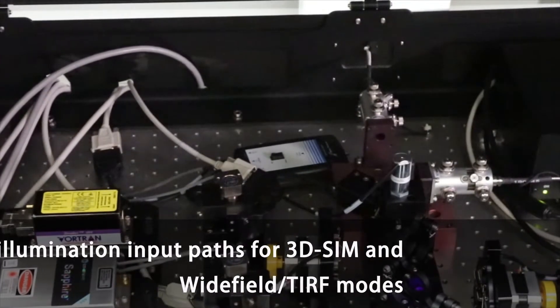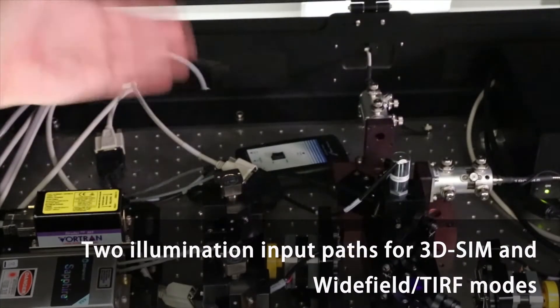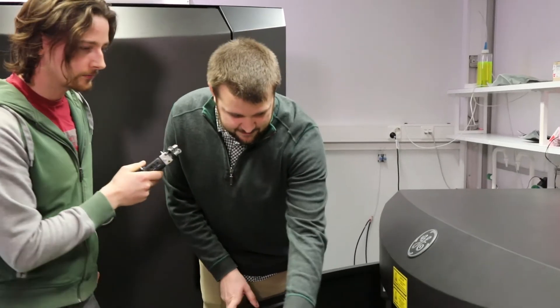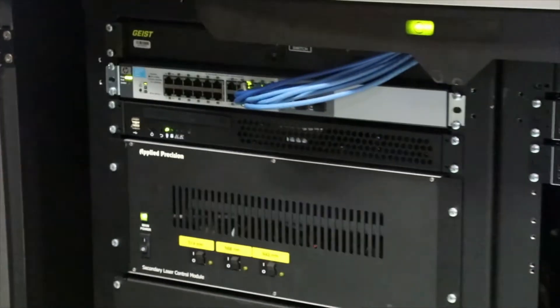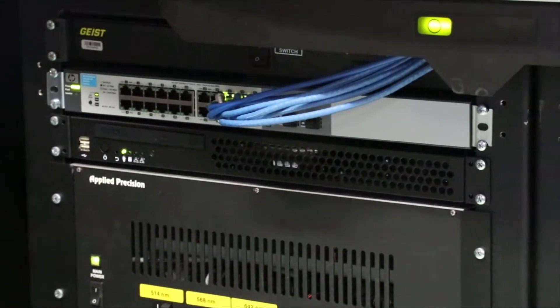The SIM fiber is straight on. If you change to TIRF mode in the software, it'll actually lift that — it's just a mirror on a little flipper motor, which will then direct it down the TIRF fiber instead. Underneath here we have power distribution, basically a power strip that everything's plugged into, so there's one single power switch that you could shut everything off in a hurry if you needed to.